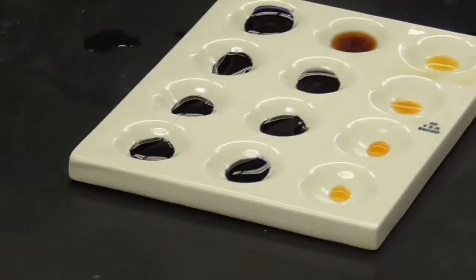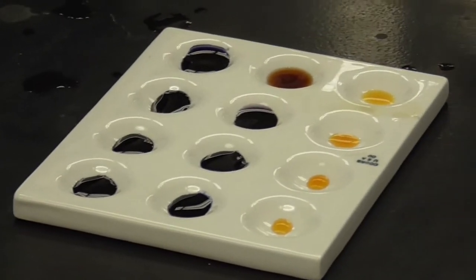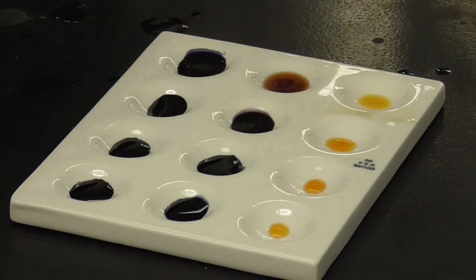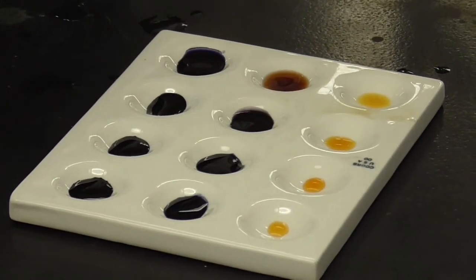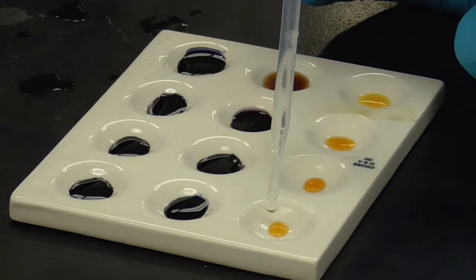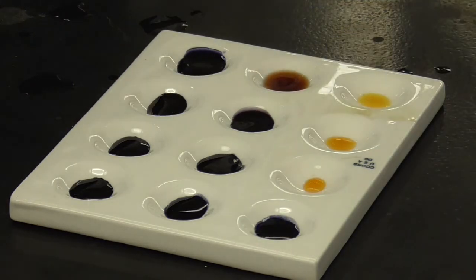Okay, there we go. 9:30, so plus the initial 30 seconds. Those enzymes now have had 10 minutes to chew on that starch to try to catalyze the breakdown of it. So once again, we'll go and we'll test them tube by tube. Tube 1, where again there was no enzyme, our control. 2, 3, 4 drops. Yep, starch is still there as expected.